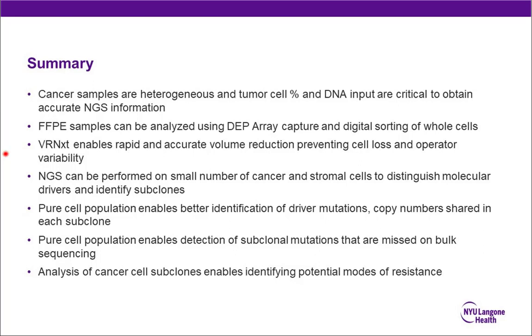I'm sure that somebody can make it work, but I think the real advantage of DEPArray is to have as whole cells as possible. You can definitely get the material off the slides, stain it, and load it on a DEPArray, but you will have to do a lot of manual selection because most of the things that come from the slide are going to be judged by DEPArray as fragments, and those are usually not considered good objects for collection. You can manually collect them if you want to, so I think it's technically possible. I just think it will be a lot of work for not really good purpose.